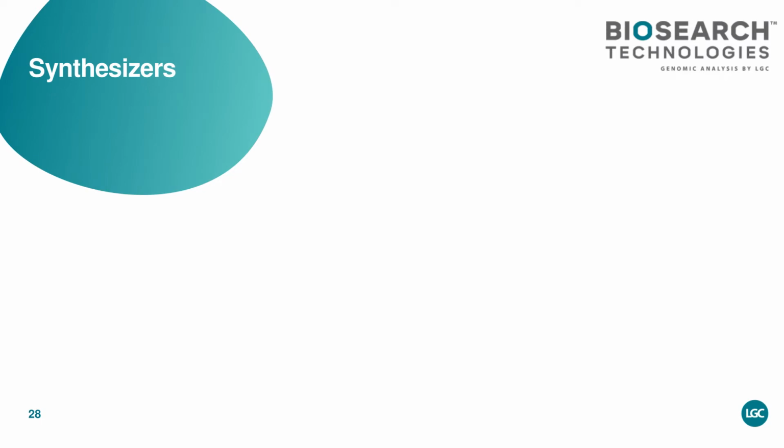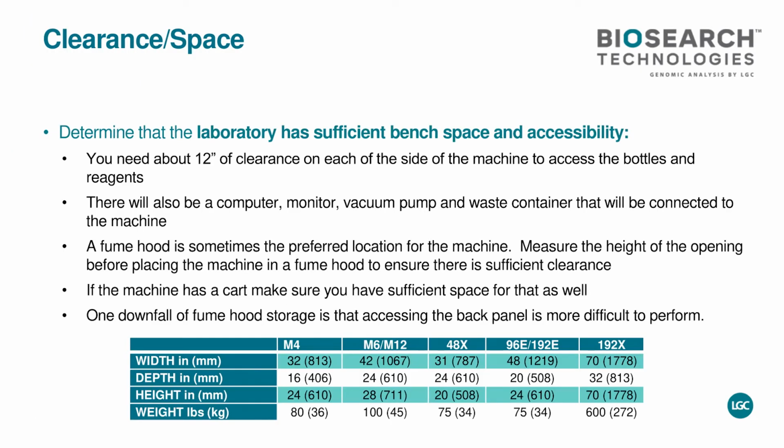What about the synthesizer? When you set up a laboratory, think about space. I know here it's not so easy, you don't have so much space, but it's very important to have enough space to be able to go on the left of the instrument, in front of the instrument, on the right, but also on the bottom. If you have to do any maintenance, anything, it's very important to think about space. Because if not, you will have trouble one day.